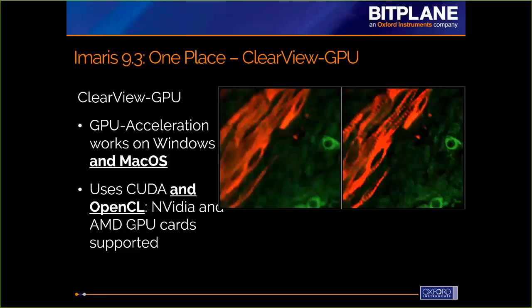And so we're hoping that many of our users will go into Imaris, and now since it is in one place, it's not a separate program, go ahead and use deconvolution where they might not have in the past and be able to get even higher quality results out of our object detection wizards.